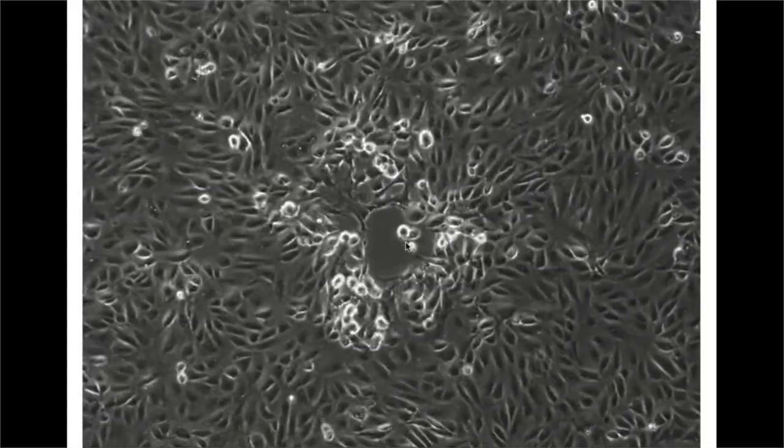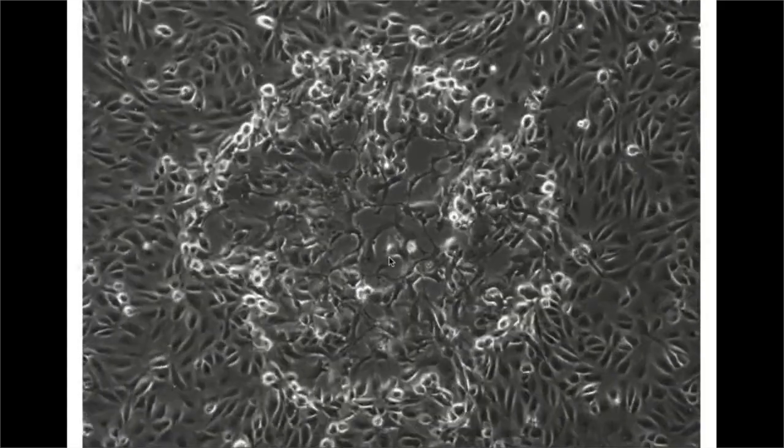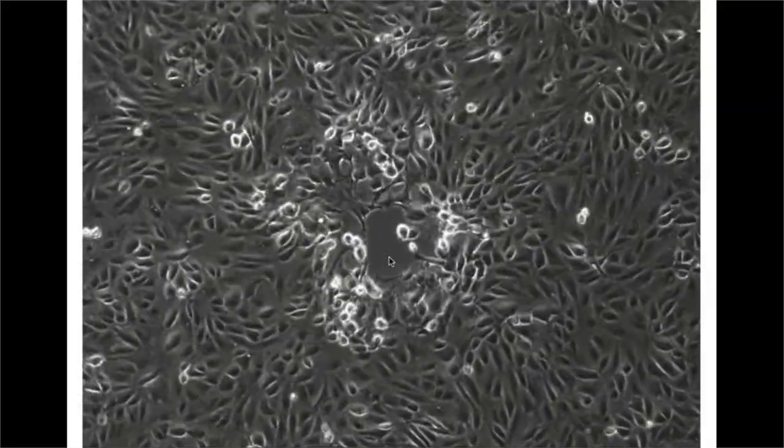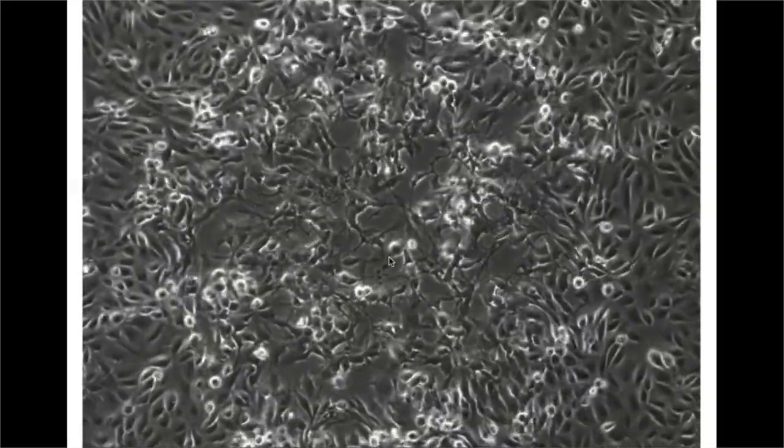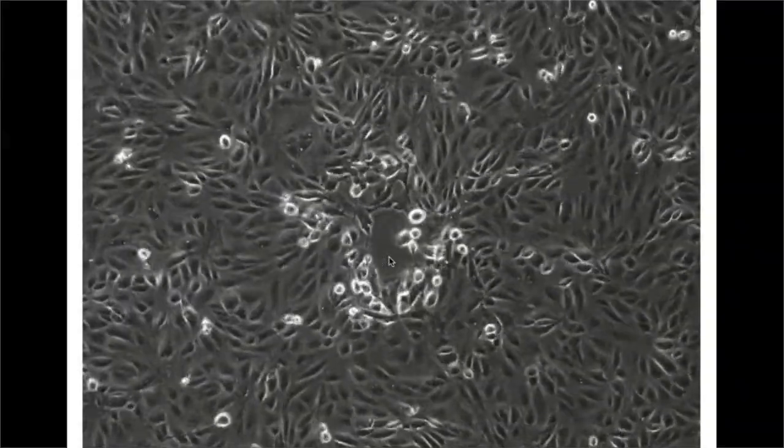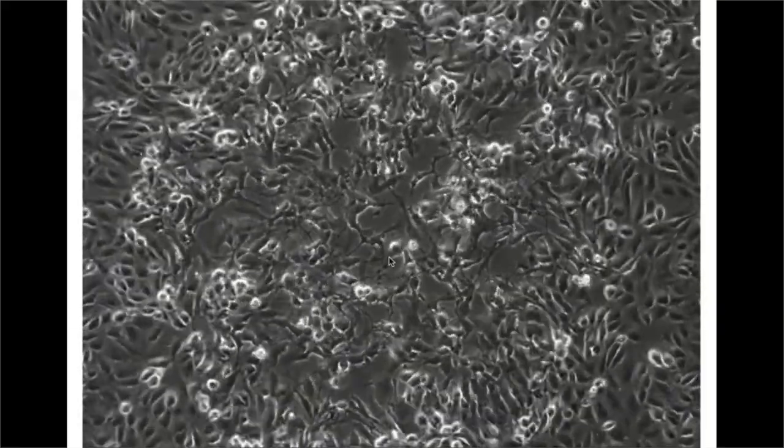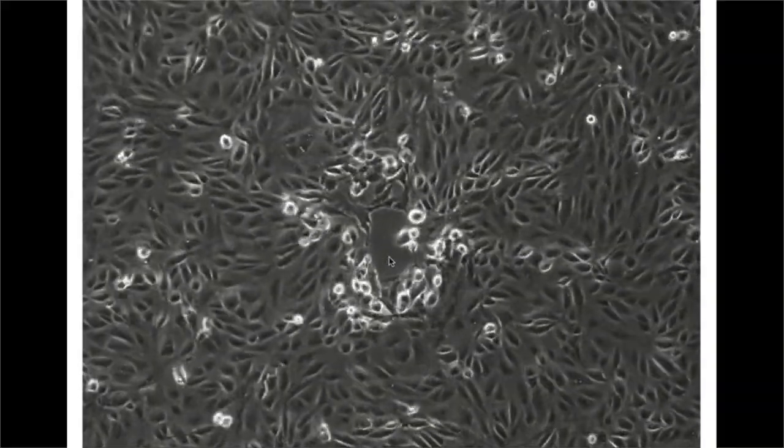What happens then is that the virus particles that are not neutralized infect the cell culture. Each virus particle can only spread to its neighboring cells, due to the agarose. So, one virus particle will cause an area of infected and thus dead cells. This is called a plaque-forming unit, or PFU.